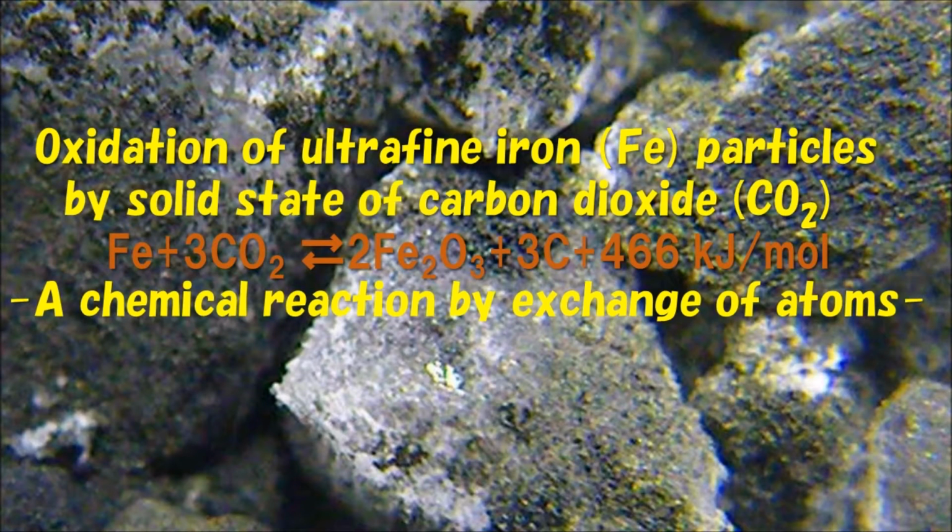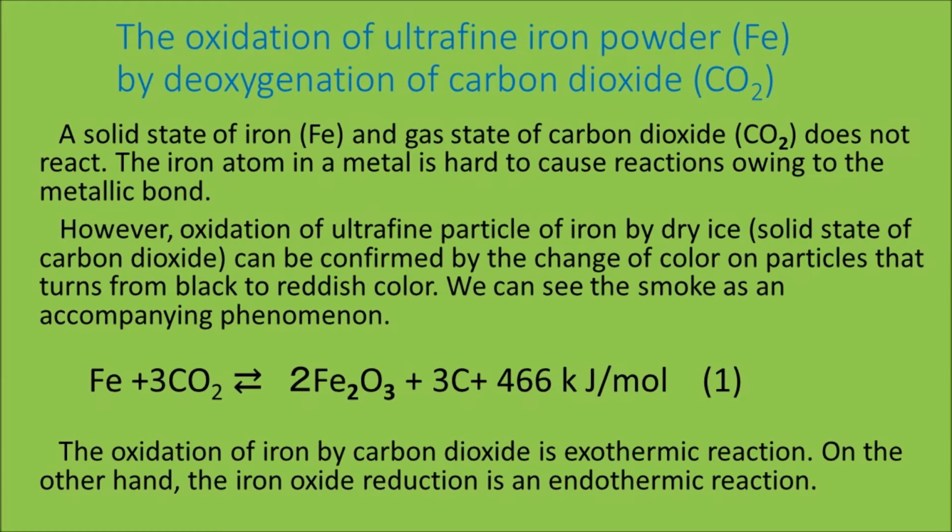This video shows the oxidation of ultra-fine particles of iron by the solid state of carbon dioxide. Solid iron and gaseous carbon dioxide do not react. The iron atom in a metal is hard to cause reactions owing to the metallic bond.